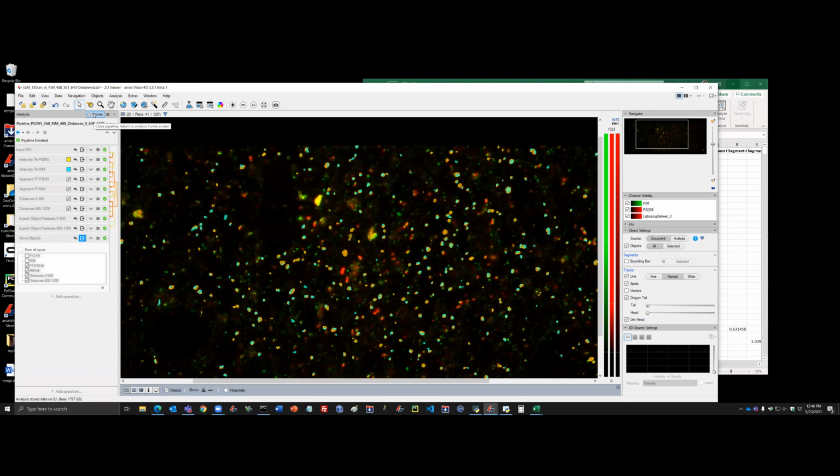Yes, so first of all, of course, we can use adaptive thresholds in the pipeline, or just set the threshold at lower levels.